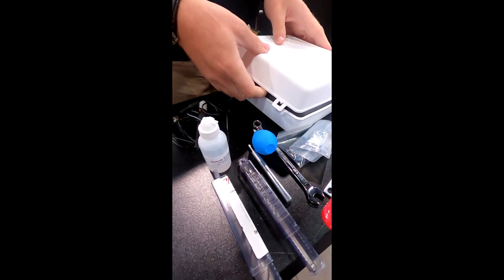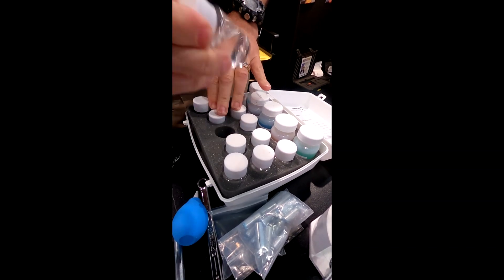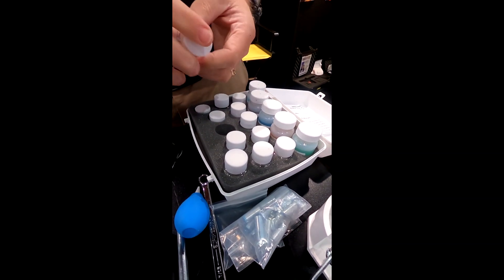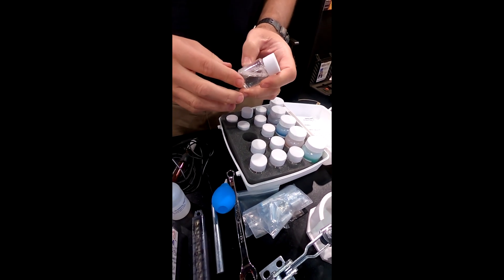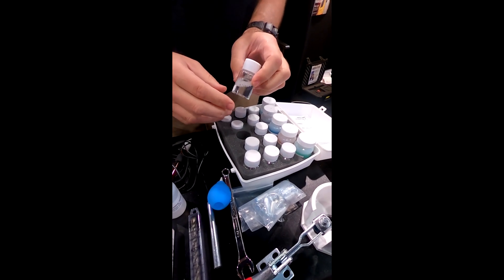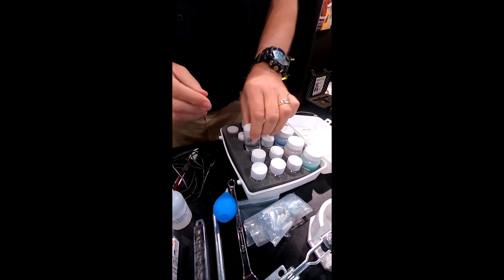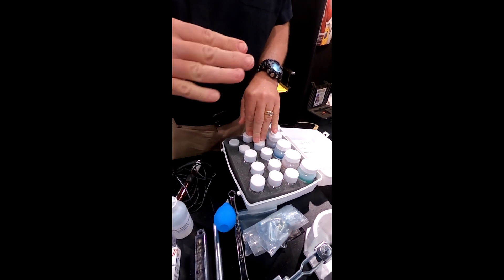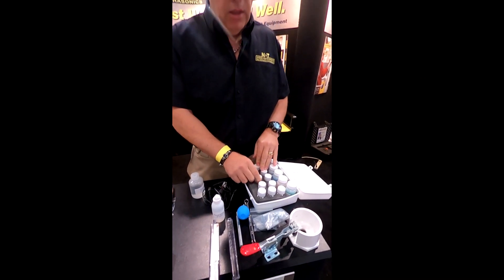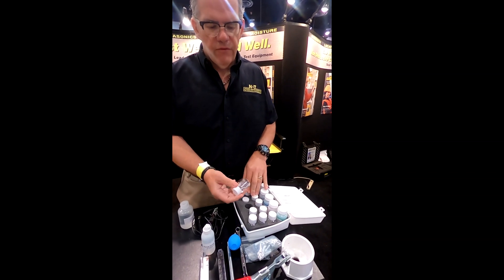You will need either CL12, which is what this is, or CL2096 which comes with 100 of these samples. You place the 3-gram sample in the extraction liquid and give it a shake. You can pretty much start taking readings immediately. They'll begin to steady out after 3 to 4 hours — it's an exponential increase, so the majority of the digestion will happen in the initial 10 to 15 minutes, but the full digestion will take a few hours.